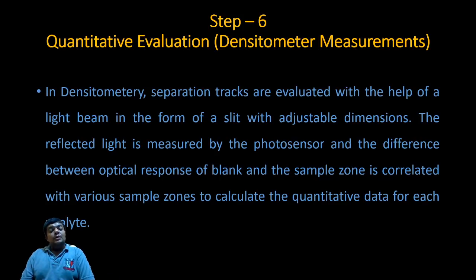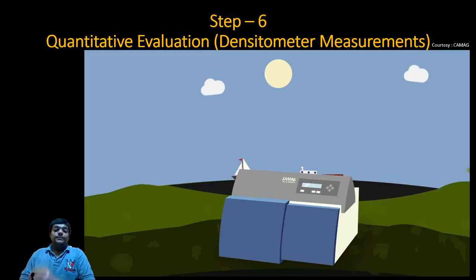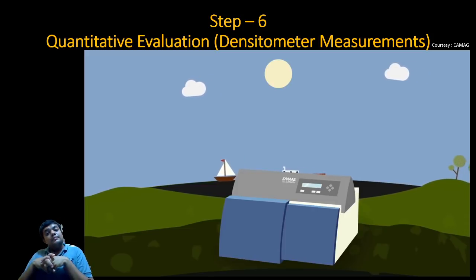Still, I have something very good for you in the coming up video. So this is the densitometer where quantitative evaluation can be done. Quantitative evaluation of the generated densitometric data.